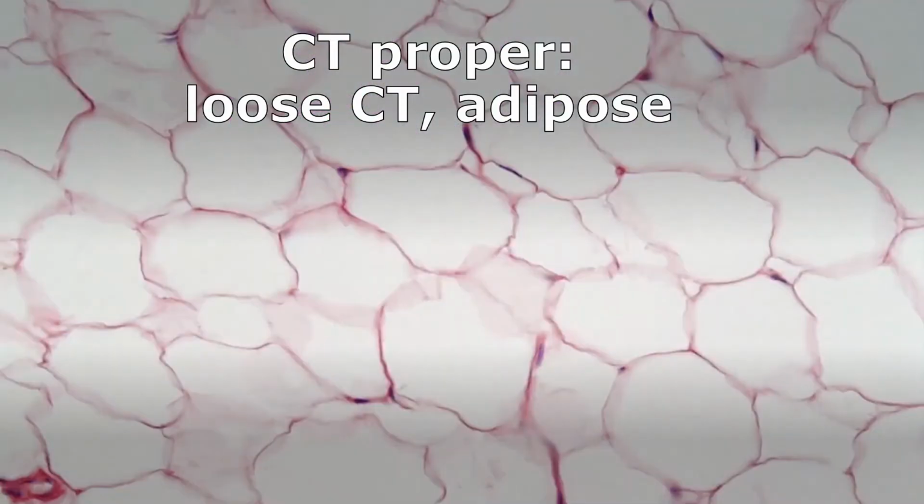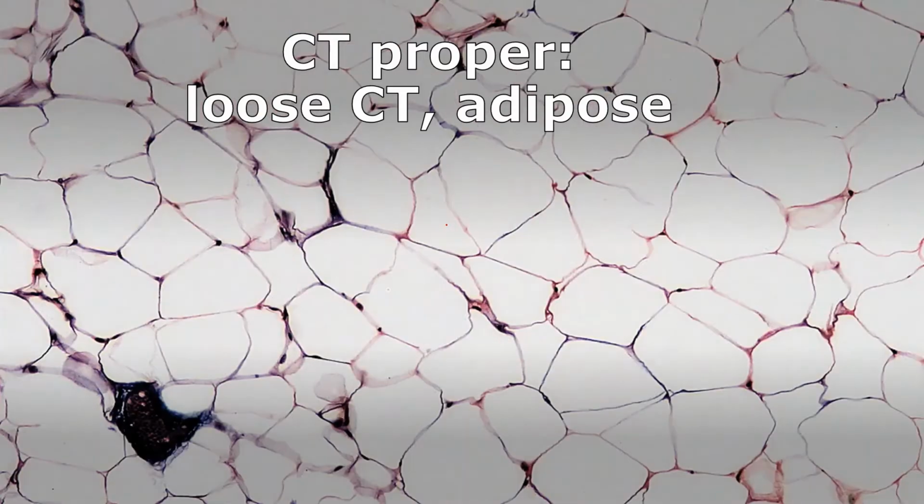Big white bubbles. The nuclei are less evident here, but you can see a few of them. Again, what are these bubbles filled with? They're filled with lipids. They're filled with fats for storage. Another picture of adipose. Big white bubbles, nuclei shoved to the side.